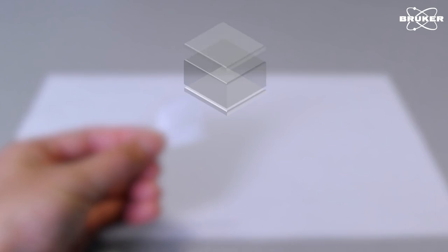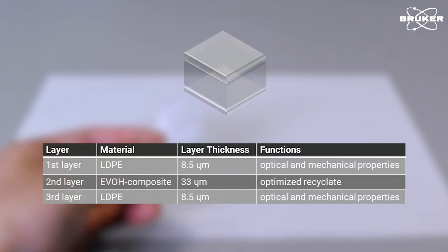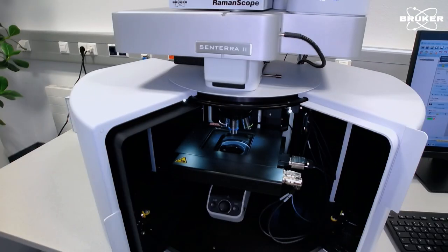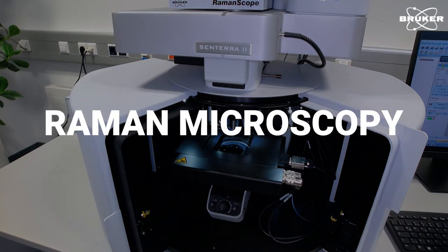Each layer inside the film serves a particular purpose, allowing the design of application-specific packaging materials. In this video, we are going to use Raman Microscopy to analyze the individual layers.